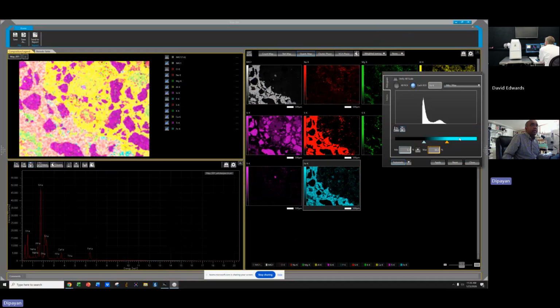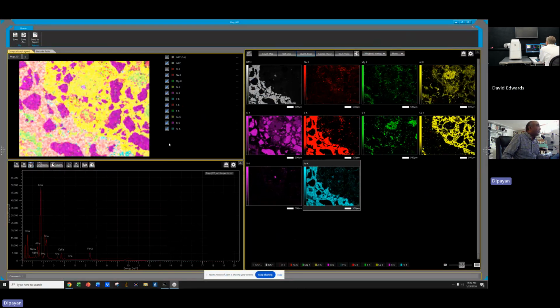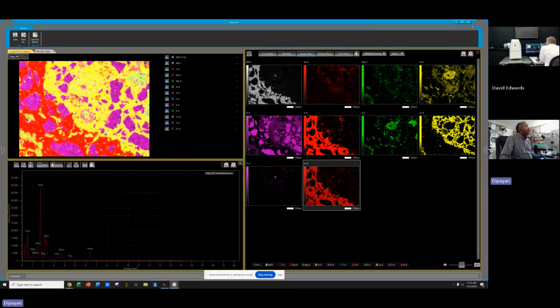Right there. No, wait, don't tell me. I think I know where to go to replace the color. Right. Oh, no, don't tell me. Hold on. I think I have to go there. Then you change. So see now, I can get it if I force it to the same color.